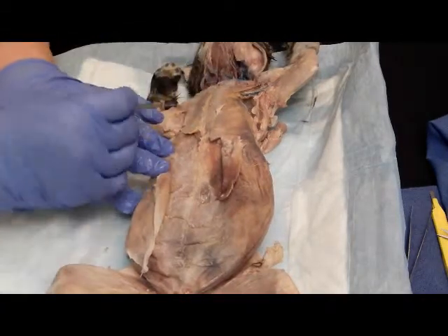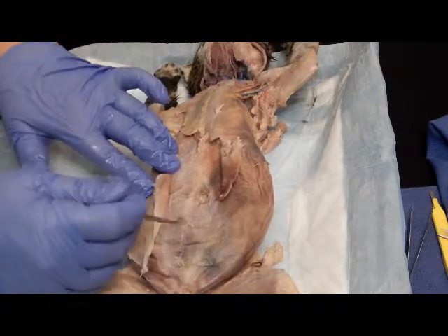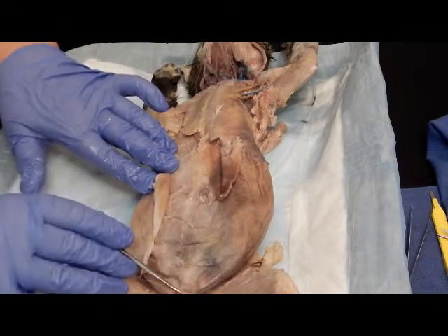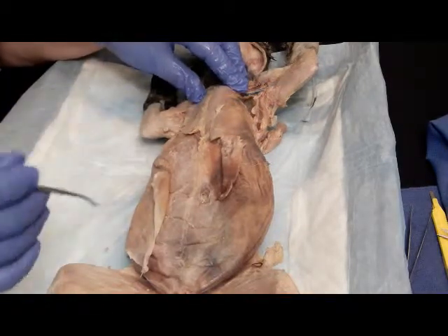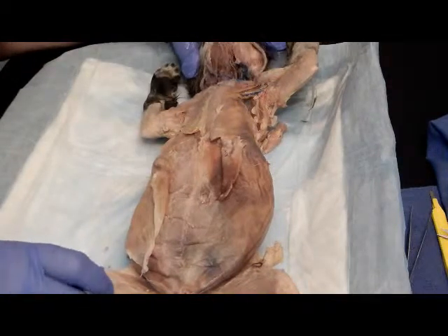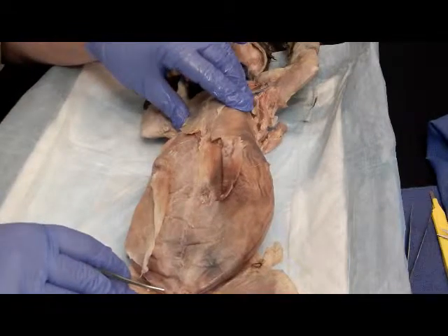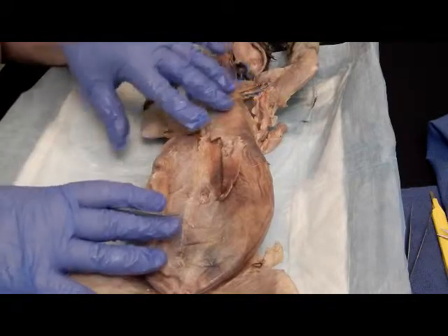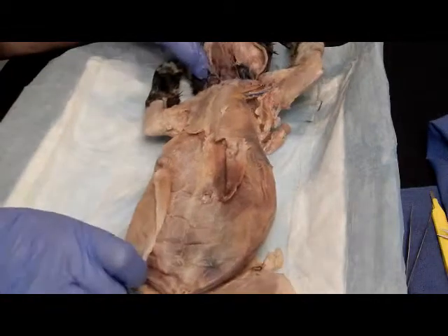The rectus abdominis runs parallel to the linea alba, and its origin is the pubic crest and symphysis. Its insertion is the xiphoid process and costal cartilages of ribs 5 through 7. Its function is to flex and rotate lumbar region of the vertebral column, fixes and depresses the ribs, stabilizes pelvis during walking, increases intra-abdominal pressure, and it's used in sit-ups and curls.